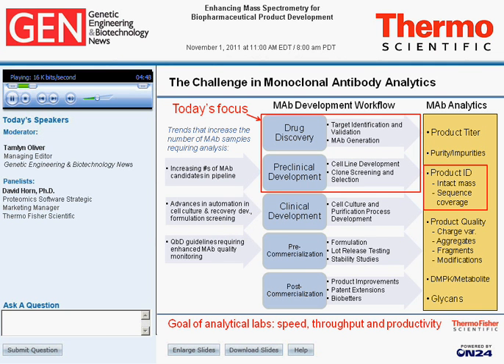This is a bit of a complicated slide. I'm not going to go through it in a huge amount of detail, but what I do want to point out, and I think many of you know, is that due to automation upstream and downstream from the analytical characterization of these antibodies, there's an increasing number of antibodies that need to be analyzed. And so anything you can do to increase the speed of your analysis and your throughput lab productivity is extremely welcome nowadays.